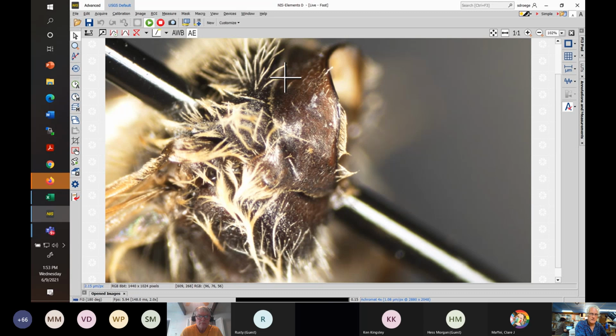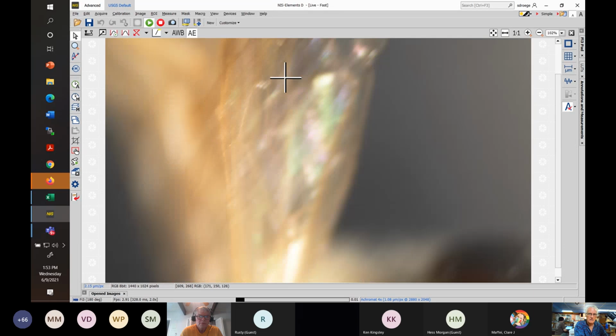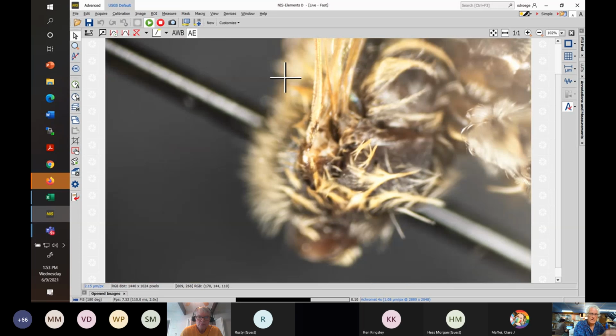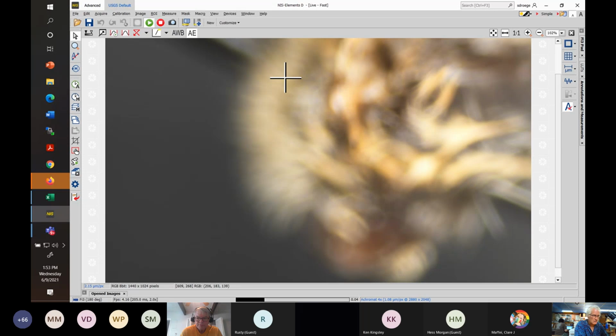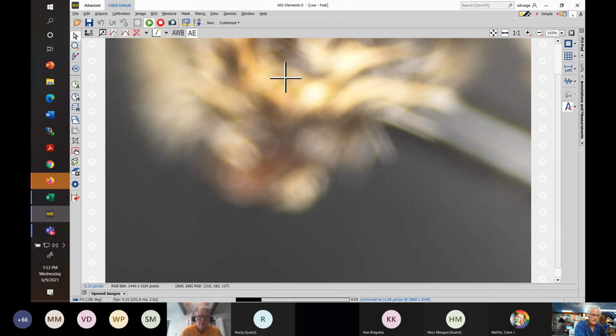I'm going to flip now to the other side and see if that is illuminating in some way. Can you say what species this is again? This is Andrena nasonii, a very common species in the east. Oops, and I can't remember how far west it goes.